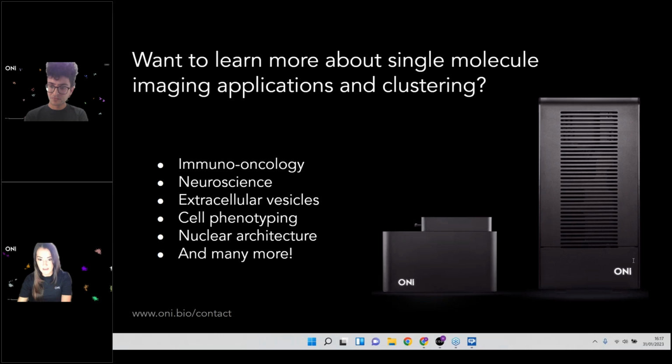First question we have is, how can I know if I should choose HDBSCAN or DBSCAN? Could my results be wrong depending on what I choose?